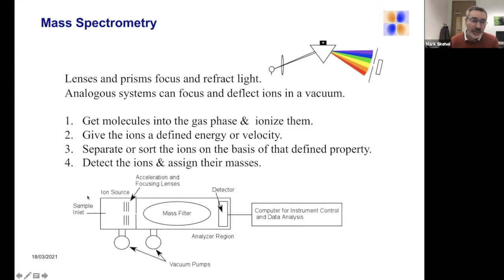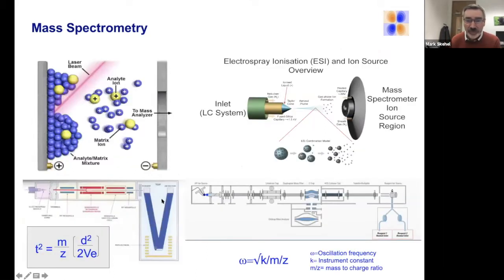We concentrate here on a chromatographic inlet system, electrospray. But again, they're all basically the same building blocks. So here, at the top part of this slide, are the two main techniques we have in the lab. I'll focus mainly on what we have at the LMB, rather than what's around everywhere else.